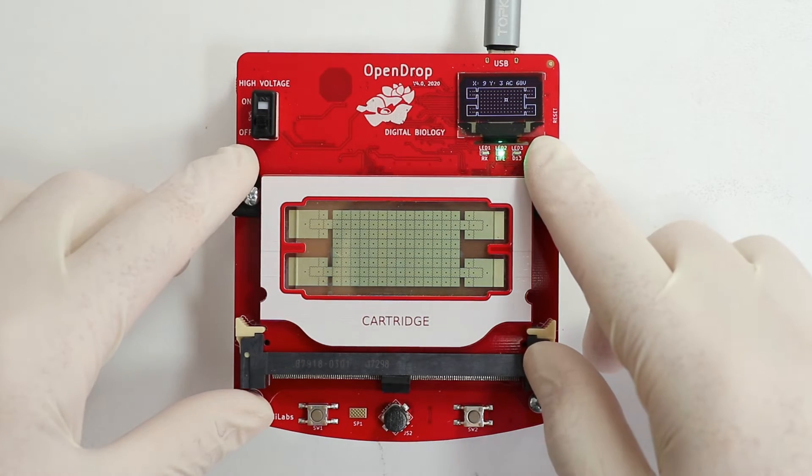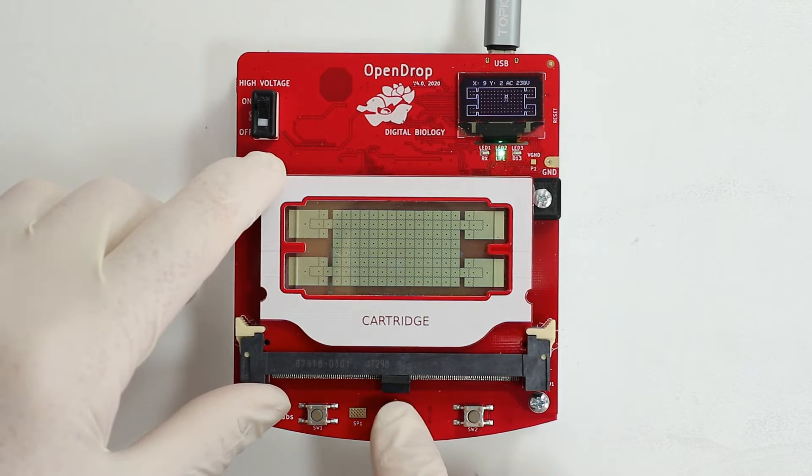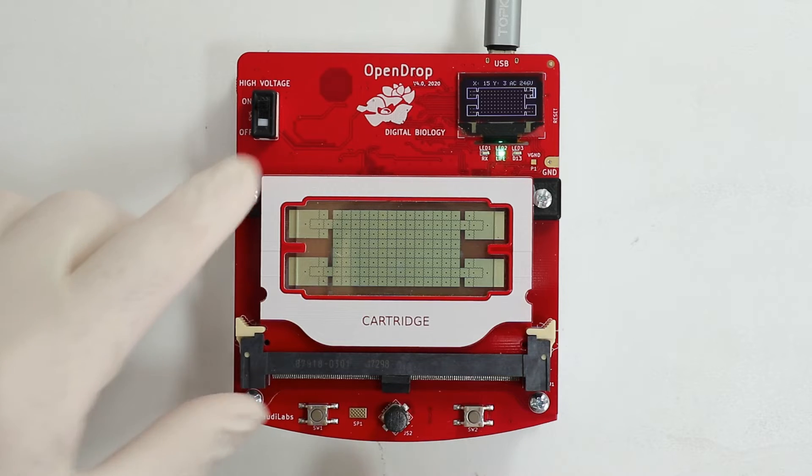The cartridge should be recognized by the OpenDrop. Now turn on the high voltage and use the small joystick to navigate the cursor to the big electrode of the reservoir.